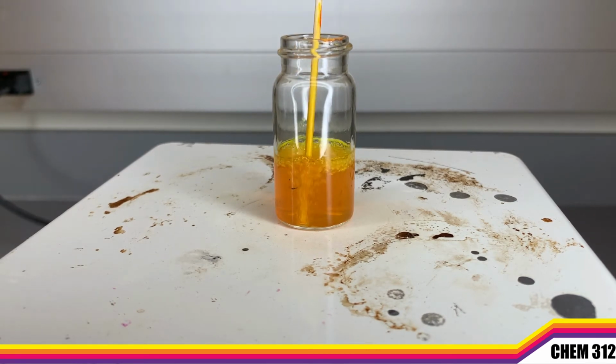We can see that the color changed. Now it's much more of an orange color, and it's currently refluxing, which is the fancy word for boiling. What we're going to do is take this off the hot plate and let it cool back down, and we'll see what we get out from this chemical reaction.